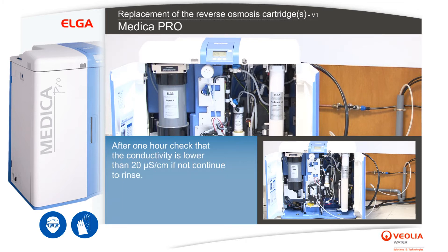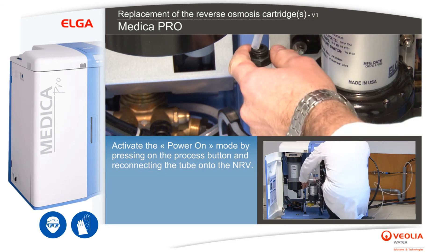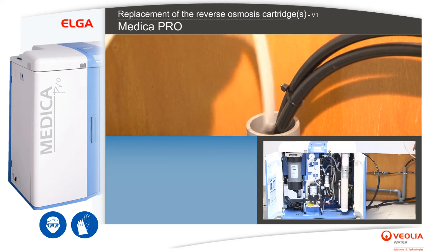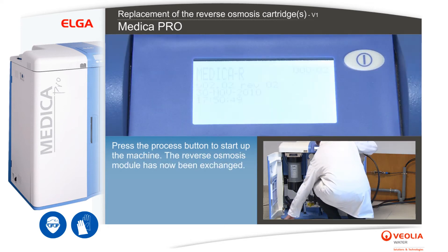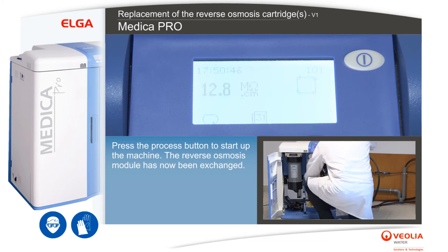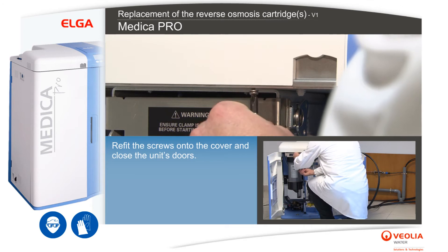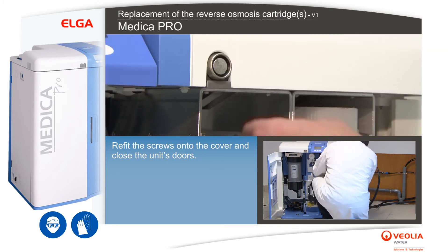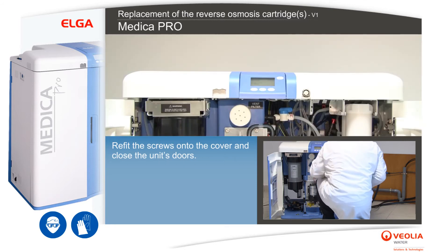After one hour, check that the conductivity is lower than 20 µS per centimetre; if not, continue to rinse. Activate the power-on mode by pressing the process button and reconnecting the tube onto the NRV. Wipe clean with absorbent paper if necessary. Press the process button to start up the machine. The reverse osmosis module has now been exchanged. Refit the screws onto the cover and close the unit's doors.